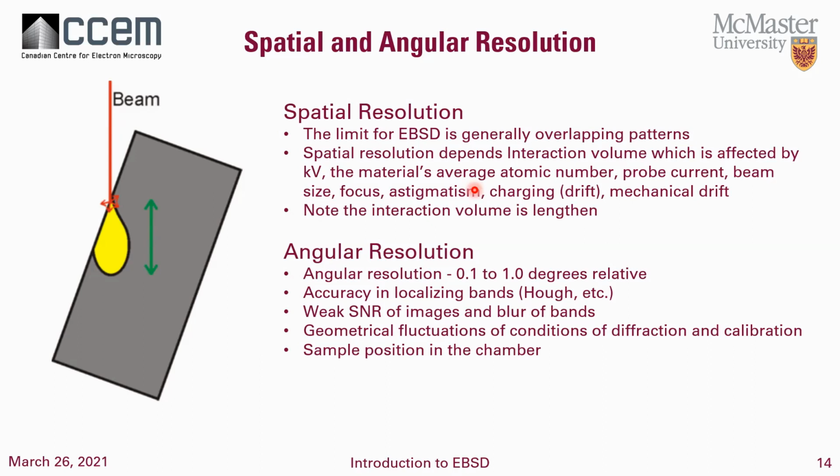The interaction volume is affected by the accelerating voltage, or kV, of the SEM, the material's average atomic number, probe current, beam size, focus, and astigmatism. It can be affected by charging. Also, because sometimes we're dealing with very small step sizes, it can be affected by mechanical drift. So don't use tape to stick down your sample.